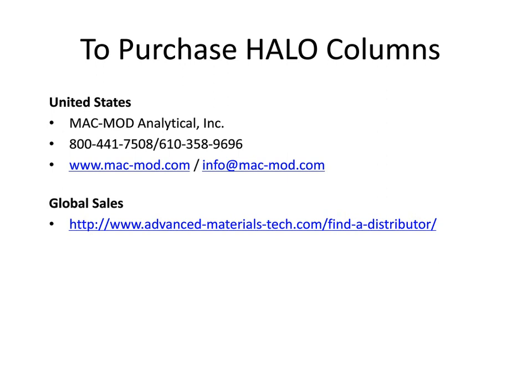Now, we used a trap pre-column strategy, so we were able to eliminate most of the pre-column band dispersion by essentially plumbing it through a trap column in front of the analytical column. The post-column, we've mostly operated in two modes, one with a UV detector in series and one where we plumb directly to the mass spectrometer.